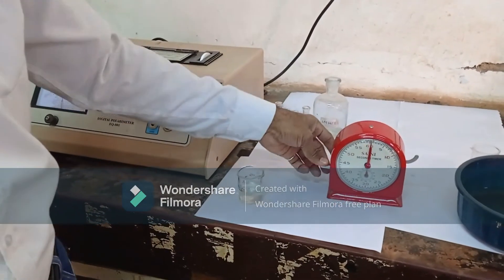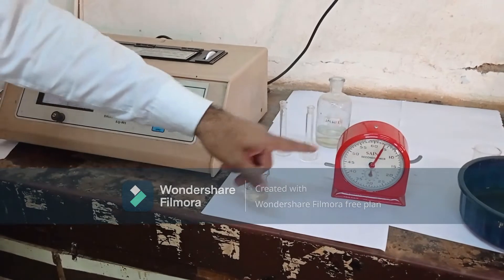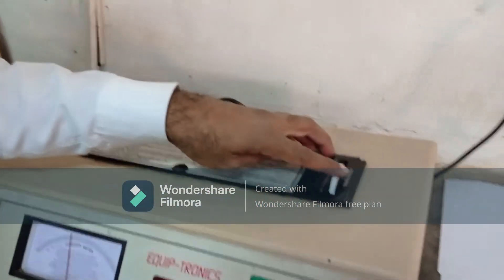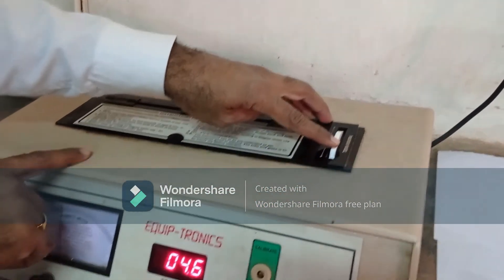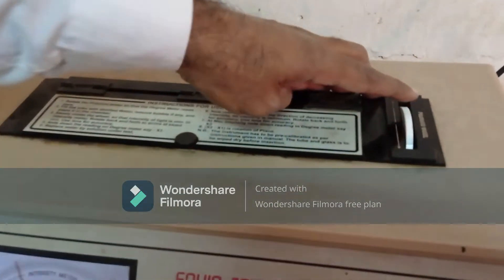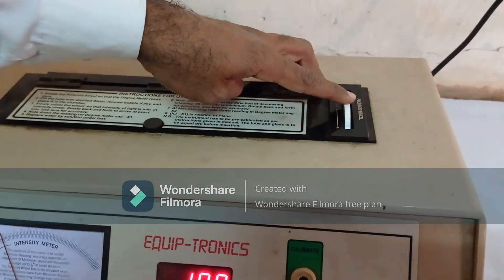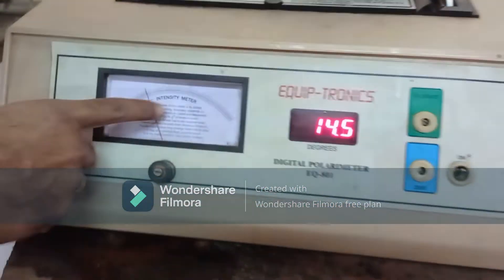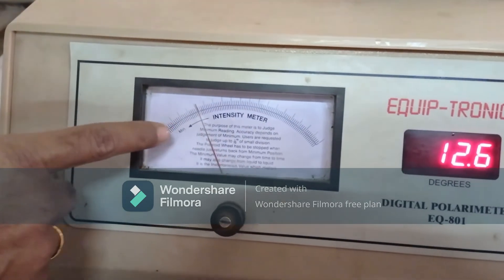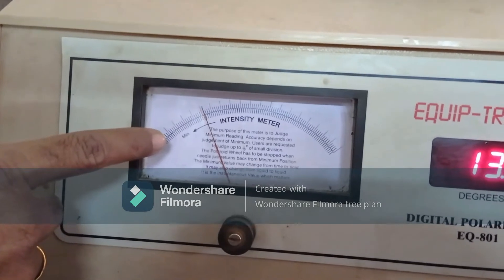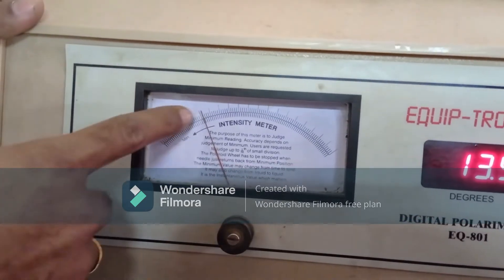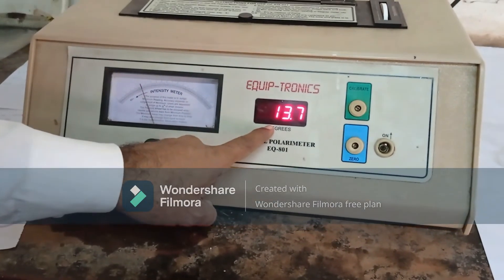Then we have to start the stopwatch. At time zero minutes, we have to take the reading. This is the Polaroid wheel — by using this Polaroid wheel, we can take our readings on the intensity meter. Move this Polaroid wheel back and forth to set the intensity meter to the minimum. Now the minimum value is set on the intensity meter, and this is the reading for 0 minutes.